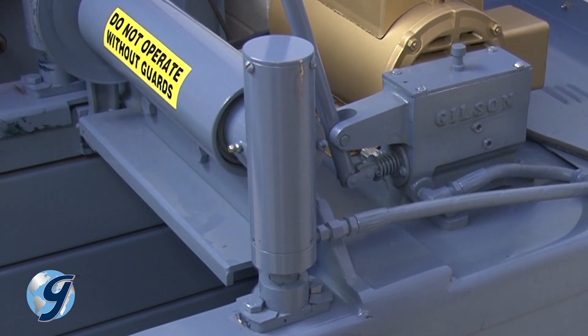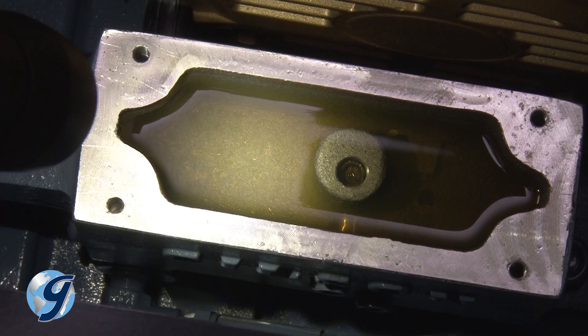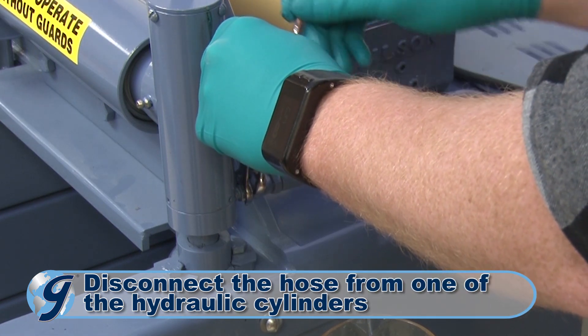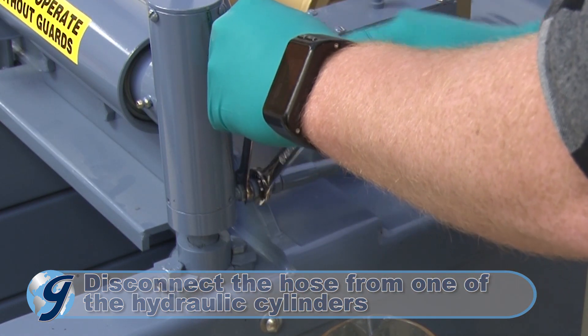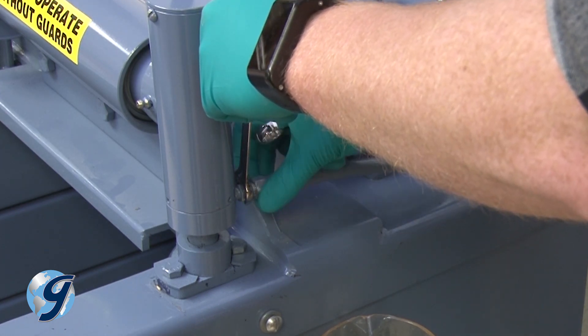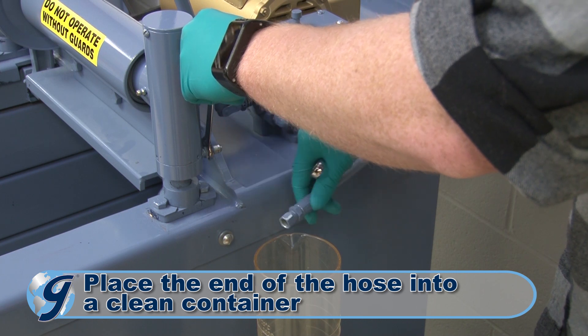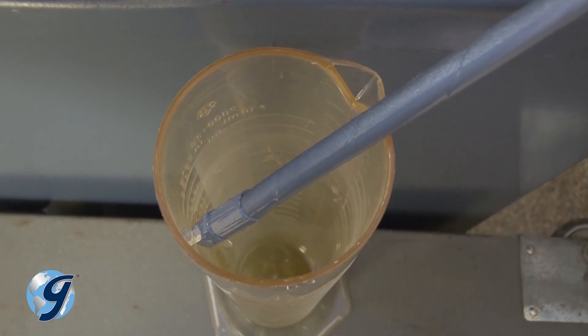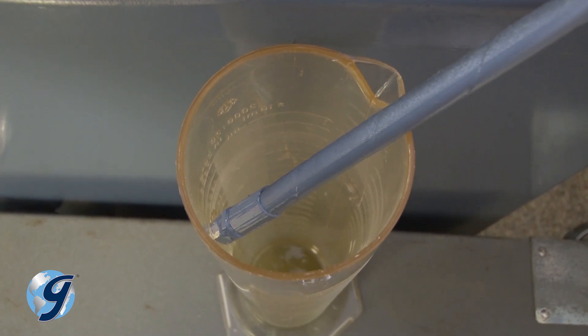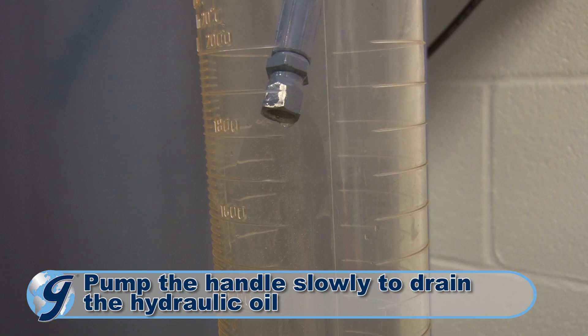To continue, we need to remove the hydraulic cylinder to access the clamp rod assembly. First, we drain the pump system of hydraulic oil by disconnecting the hose from one of the hydraulic cylinders, leaving the other end of the hose connected to the pump. Place the free end of the hose into a clean container at a level that will allow gravity to empty the system of hydraulic oil. Pump the pump handle slowly to drain the hydraulic oil from the system.